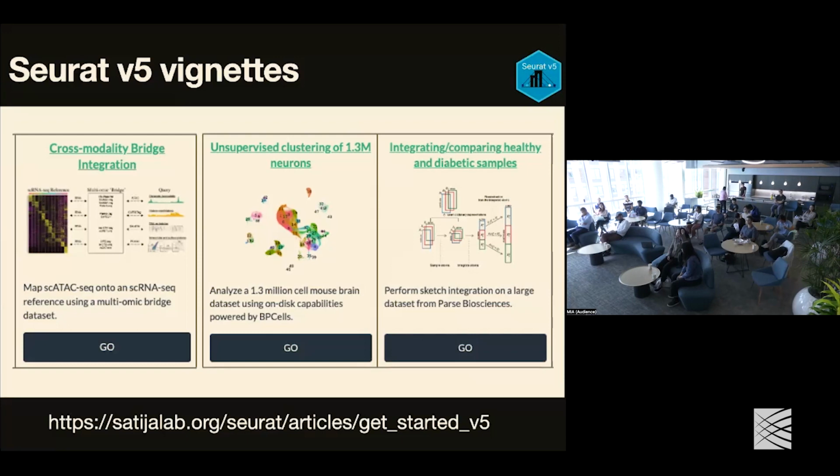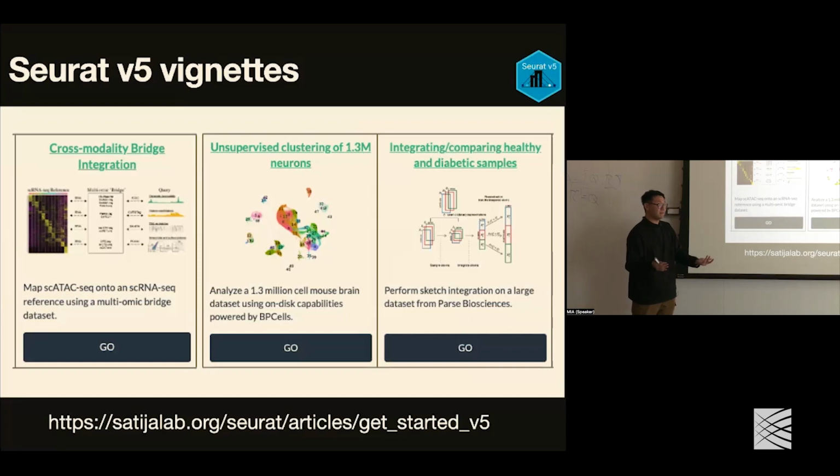Yeah, I think it depends. For example, if you do a large-scale T cell perturbation experiment, there are a lot of in vitro T cells. But the perturbations also provide signal. So in theory, you can also do the sketching and integration on the Perturb-seq, because when the perturbation has a strong signal, it has a big weight in the gene covariance matrix of that data, and you can capture that. So that is not a big problem. It's mainly about whether the cells have unique variance, unique signal in this data set. Would it be accurate to say that in the case where you have a lot of cells but no unique variation, then you can take any? Yes, then you can uniformly sample them.